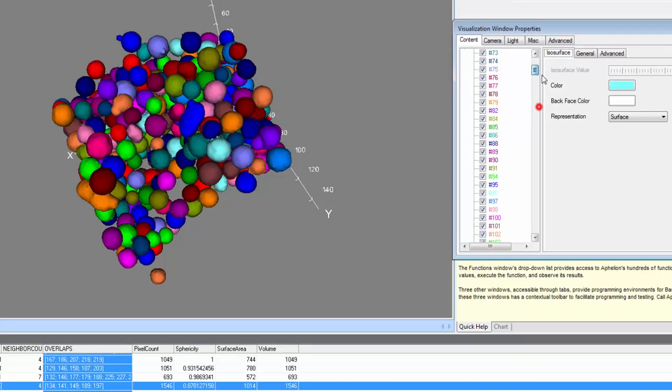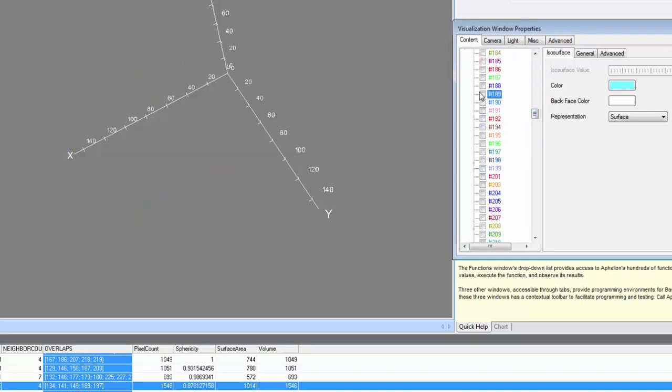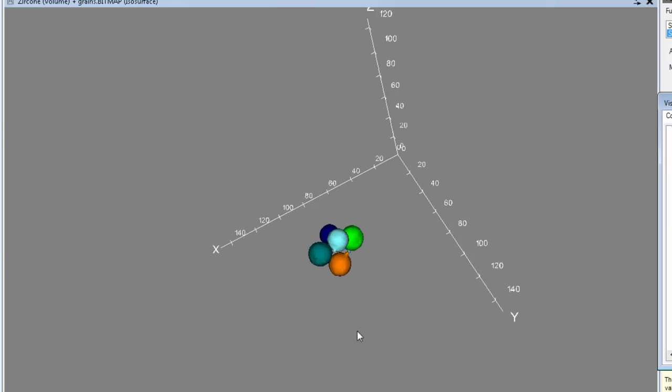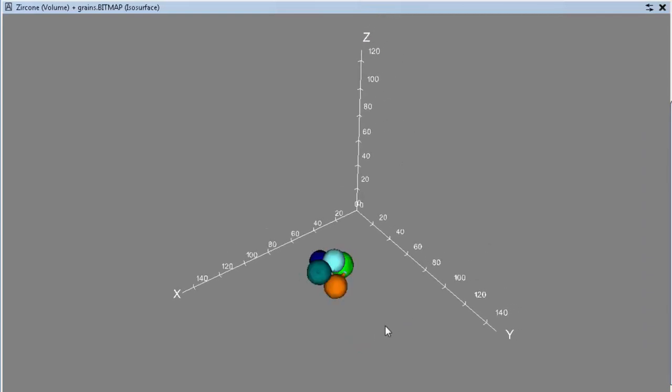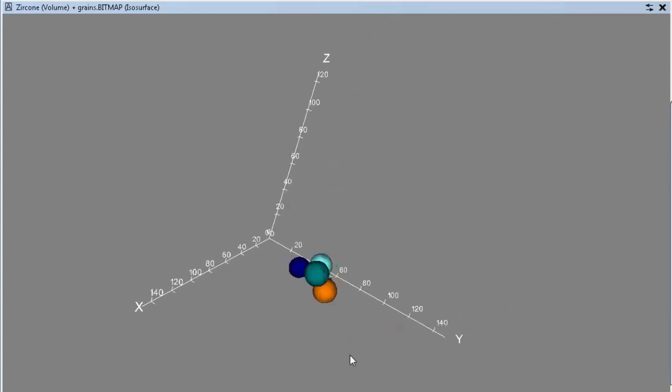The properties of the visualization window can be used to select just object 189 and its 4 neighbors. Now the object and its immediate environment can be explored in great detail.